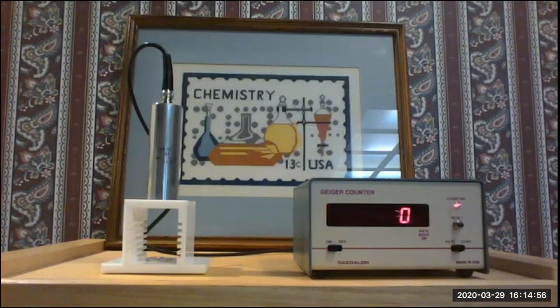as time goes on, right? So even though you would naturally think that this would be time equals one, this reading of 2522 is going to be our T equals zero reading.